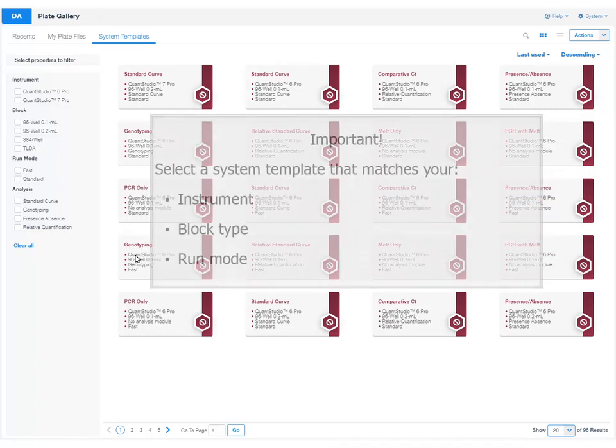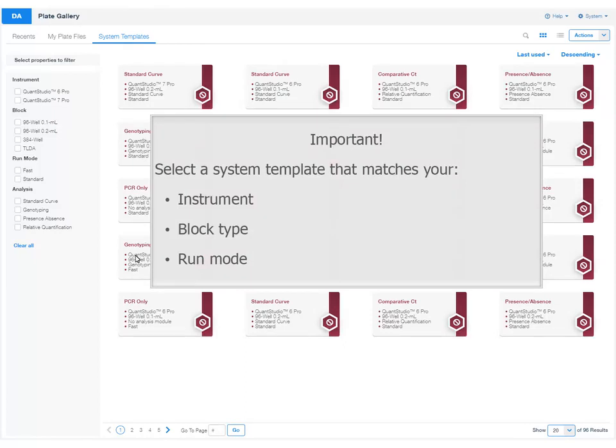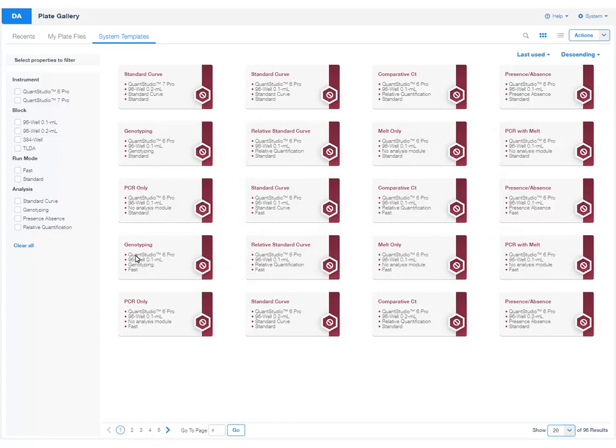It is important to select a system template that matches your instrument, block type, and run mode. These properties cannot be changed once you create the plate file. To find a compatible system template, select the appropriate properties on the left side of the screen.